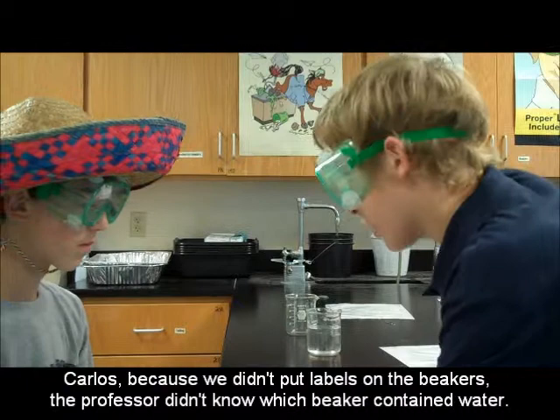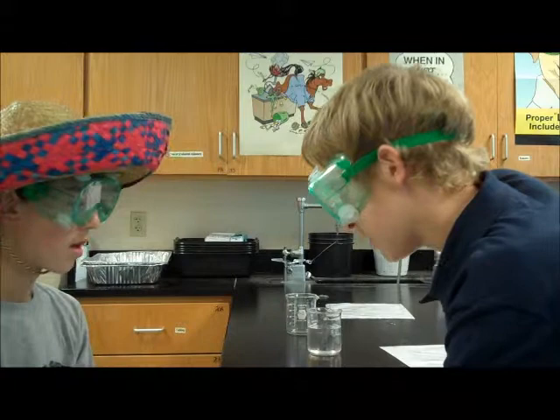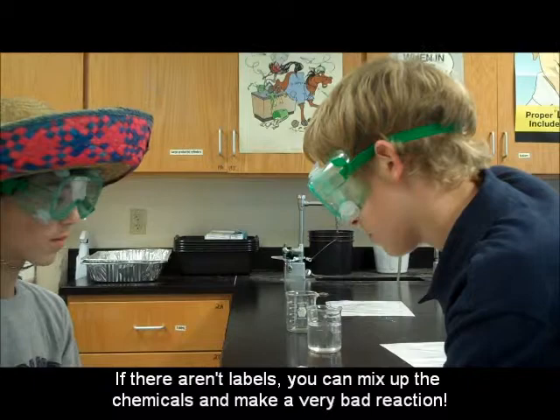What happened? Carlos, because we didn't put a label on the bottle, the professor didn't know what was water. If you don't have a label, you can't identify your chemicals, and you can cause a very bad reaction!